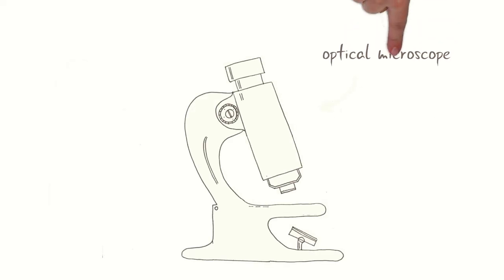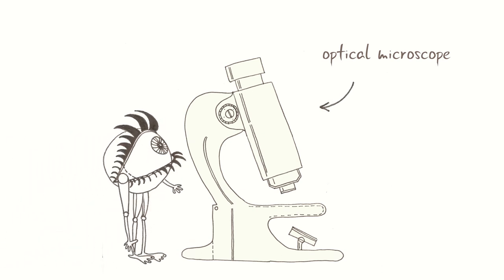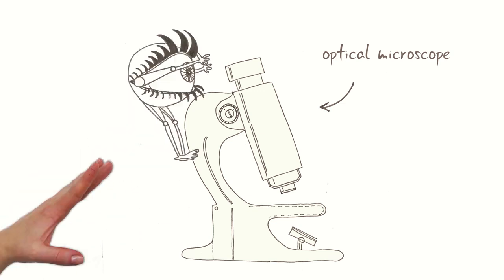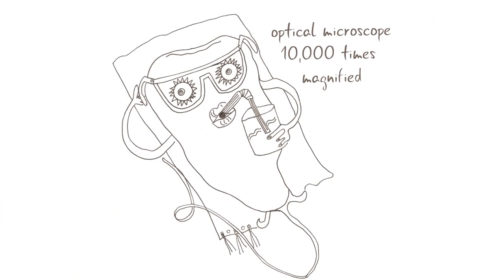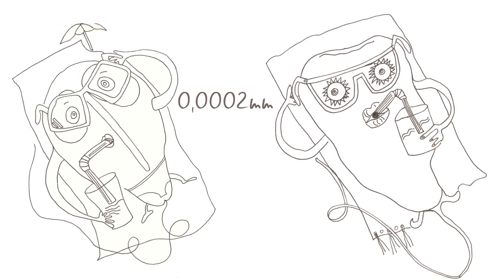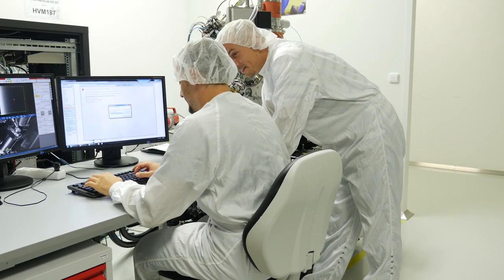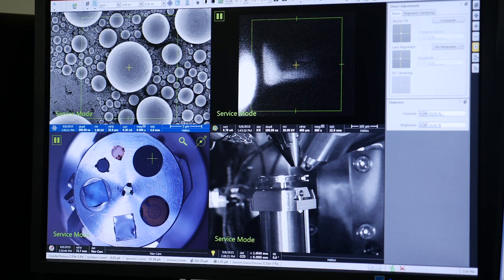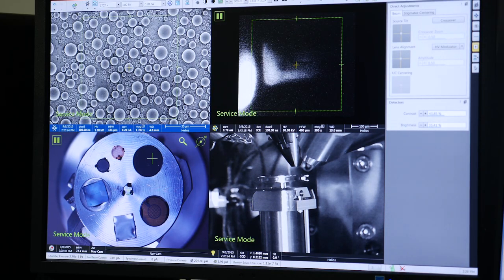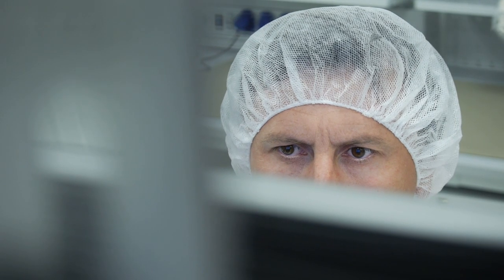How does such a microscope work? The optical microscope has been known since the 17th century. The modern optical microscope has magnification of about 10,000 times and makes it possible for the human eye to distinguish objects that are 2/10,000ths of a millimeter away from each other. It is this resolving power of the microscope, i.e., the ability to distinguish 2 very close objects in an image, which is one of the most important parameters. The level of magnification just makes it possible to picture how the image was enlarged. However, it does not say whether we can see anything in the picture.